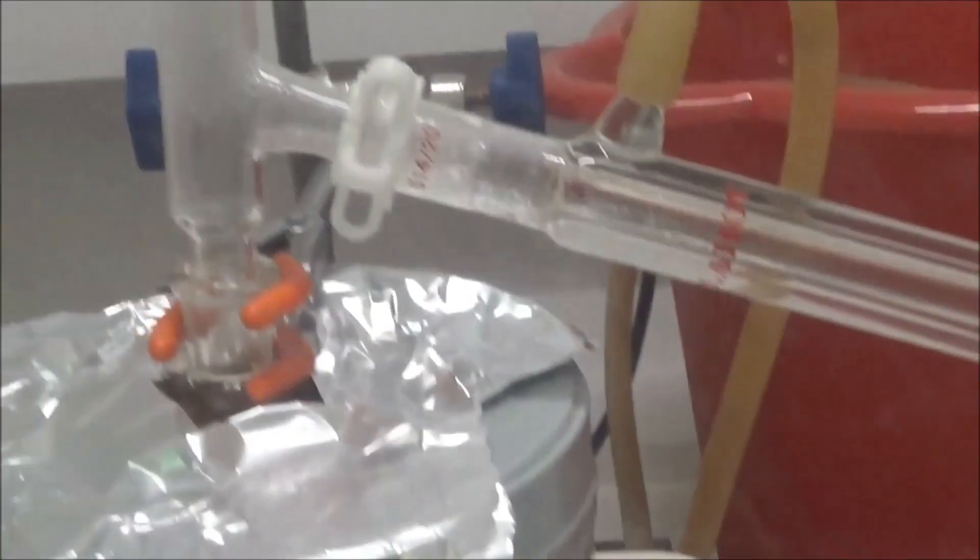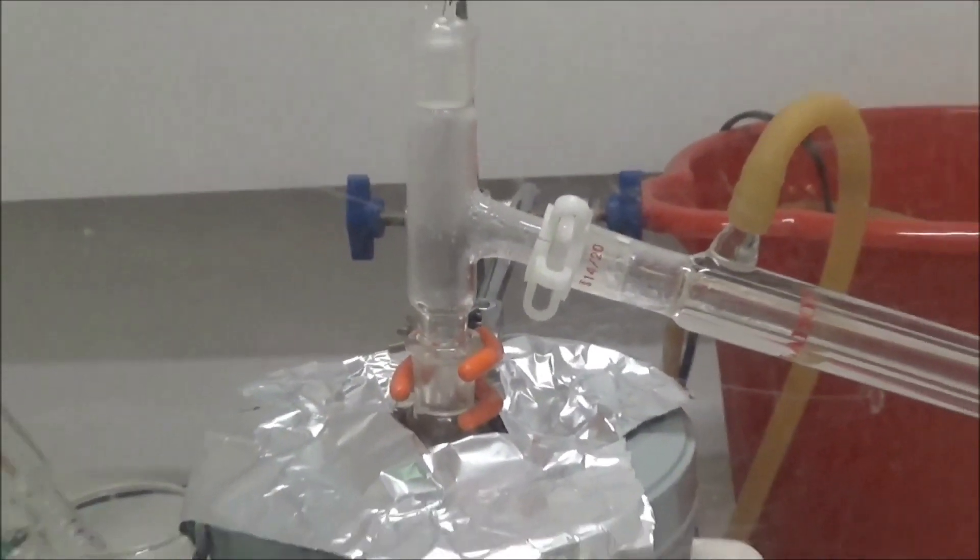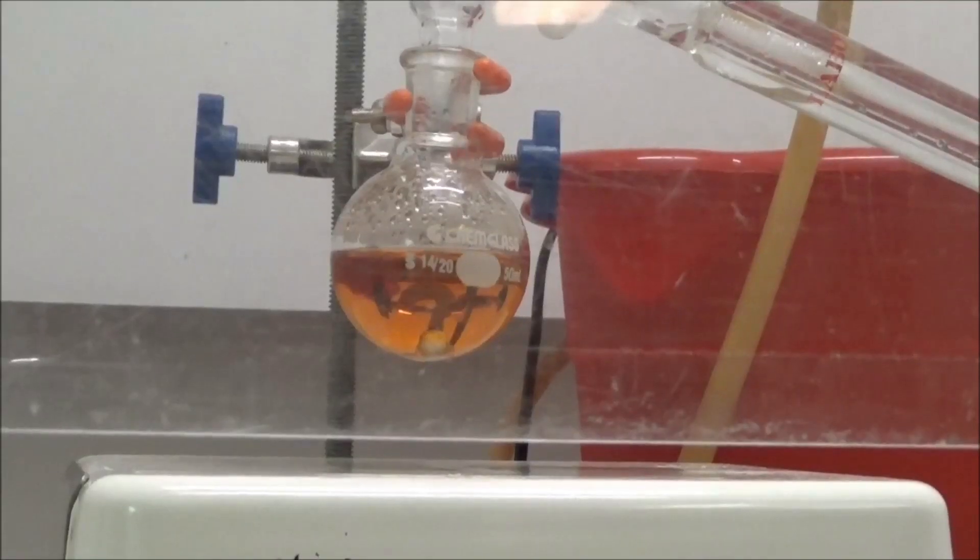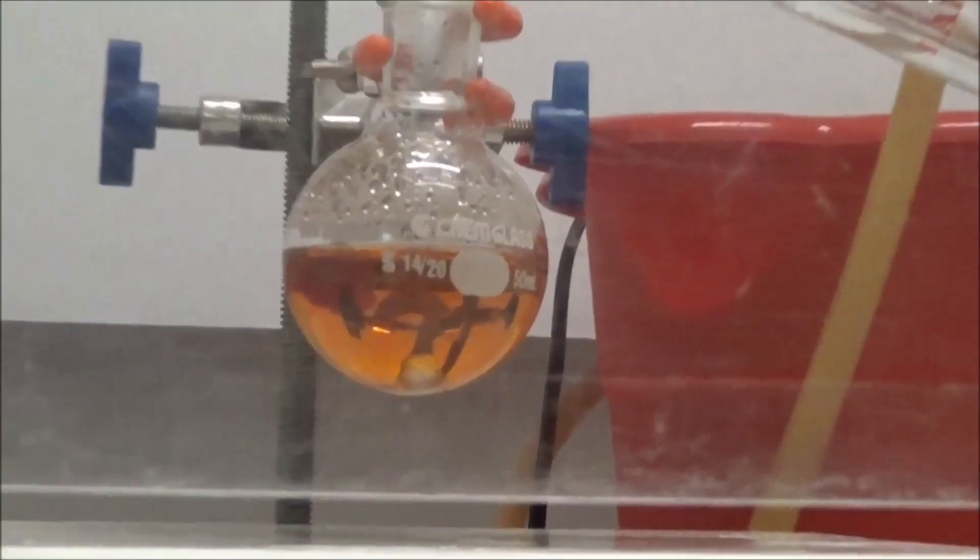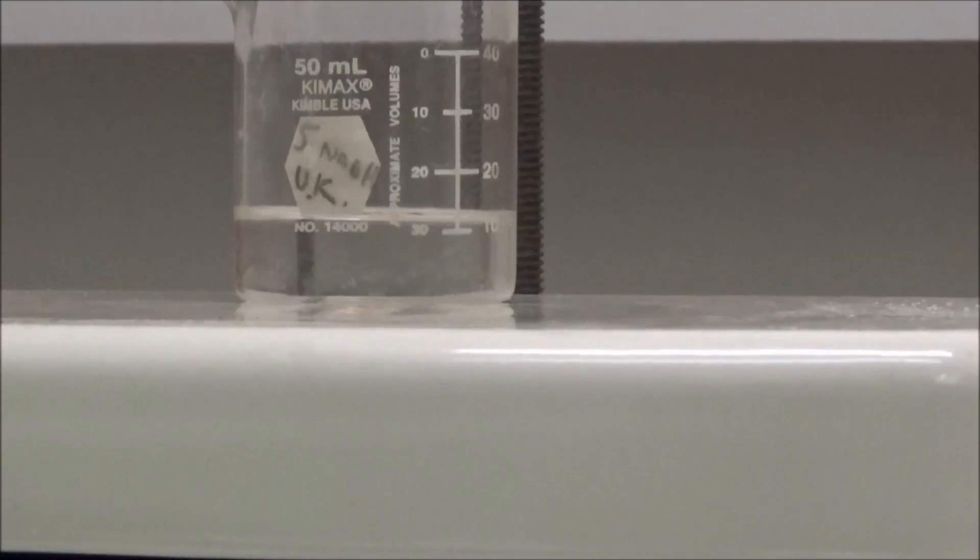After this, the distillate separated into two layers, and there was only one layer present in the boiling flask. The bottom layer, seen here, is the bromobutane.